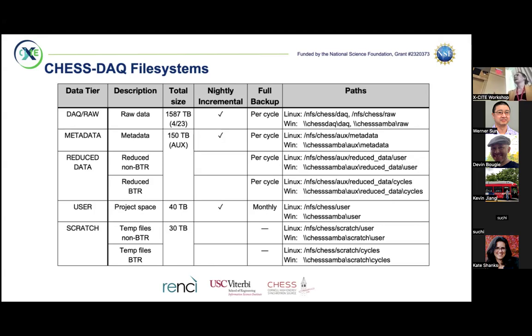The metadata is a very important folder. This also gets nightly incremental backups, and this is where you'll want to keep things like your beam time notes or anything that you're generating at the beam time that absolutely can never be replicated.